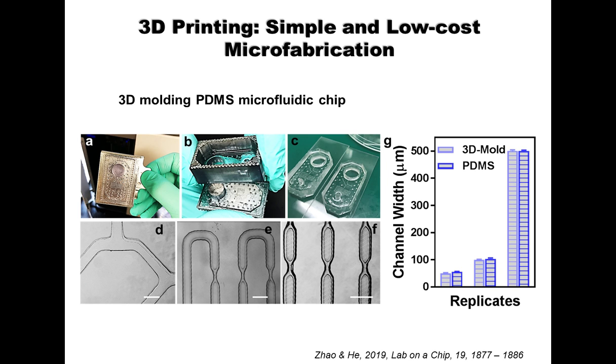We also characterize the molding precision. We compare the channel width of the molds and see how comparable they are with the molded PDMS. Basically, for channel dimensions from around 50 microns to 500 microns, they can replicate very well with good reproducibility.